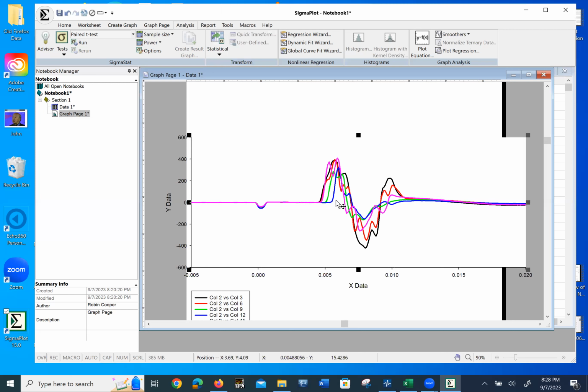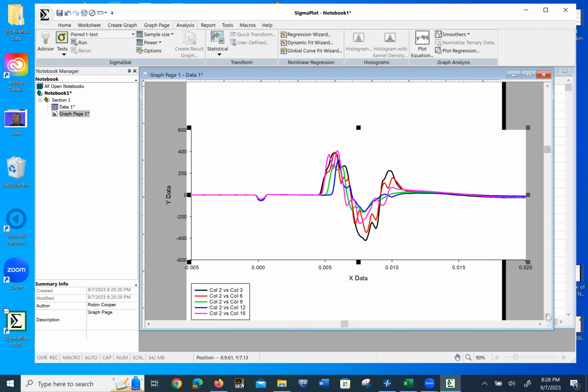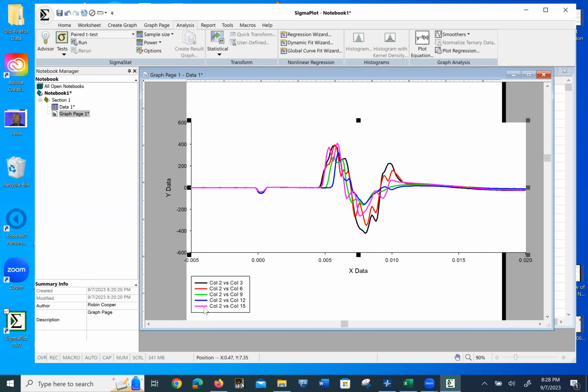30 is just really a big delay, and then we washed it out. And the washout was in purple. Look at this. The delay has come right back. It is no longer delayed. It's right on top of the black. So now we've changed our conduction velocity back to control pretty much, but the amplitudes are a little funky. Still got this doublet in there, but relatively about the same size. Look at the purple here compared to the blue. It's actually coming back towards the black line.